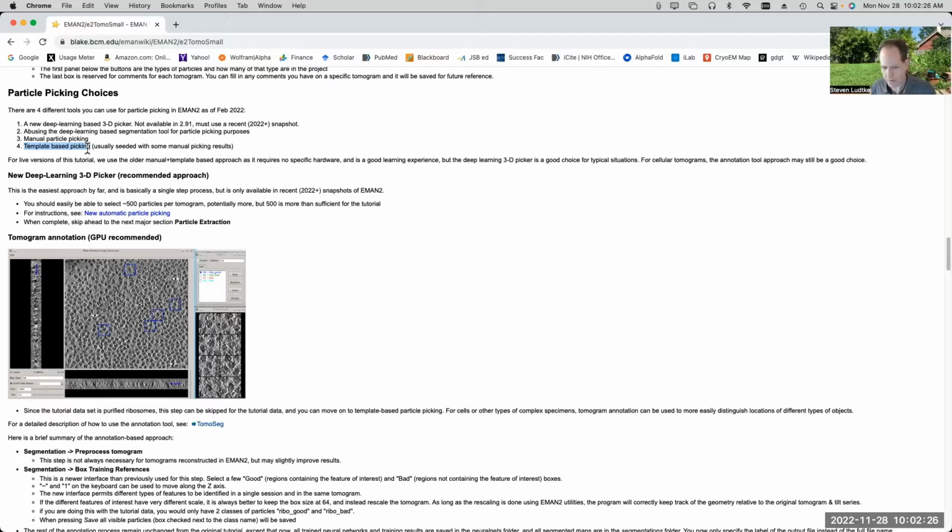So if you think about having a high resolution ribosome structure with all of its internal features and all the RNA helices and everything like that, if you have that high resolution structure and it'll be say 300 by 300 pixels or something, if you want to generate all of the different orientations that you need to check to find those particles in 3D space, you have to generate a massive number of different orientations, right?